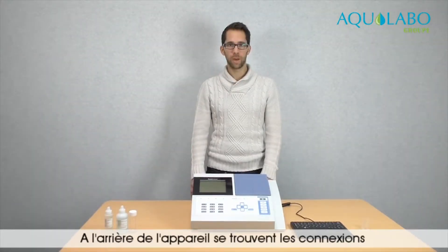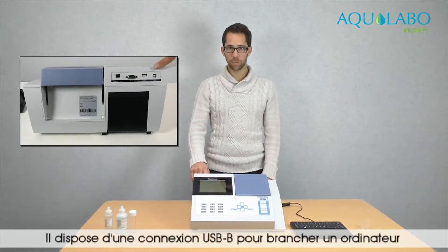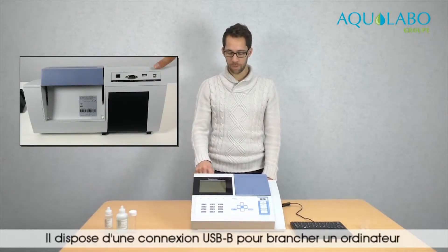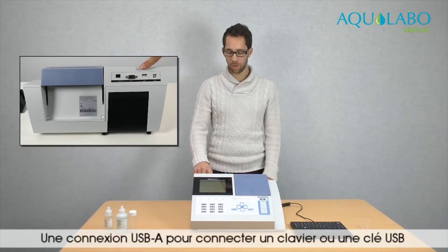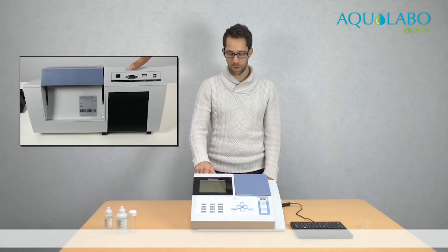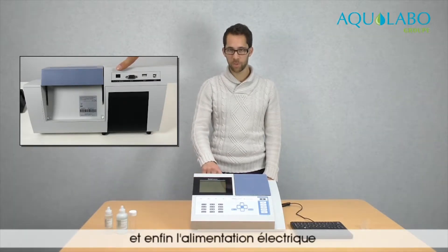At the back of the device, there are the connections. There is a USB-B connection to plug a computer, a USB-A connection to plug a keyboard or a USB stick, a RS232 connection to plug a printer, and a power supply.